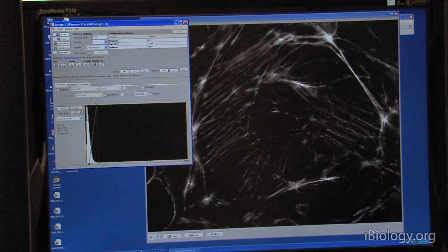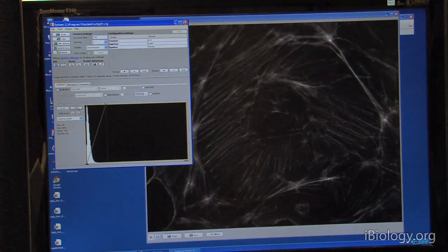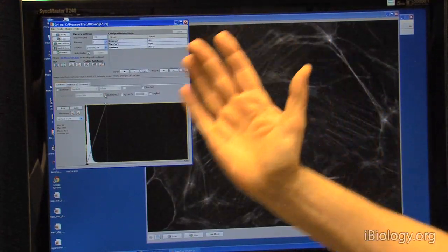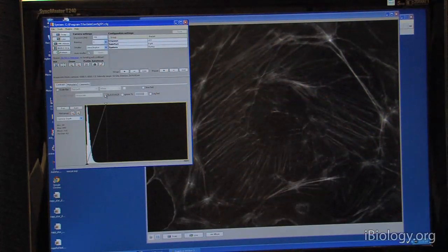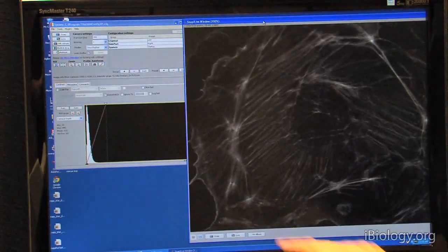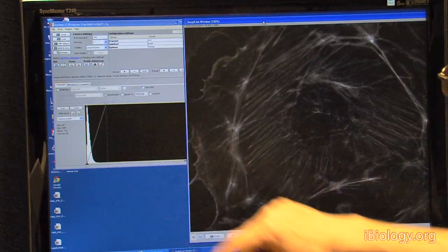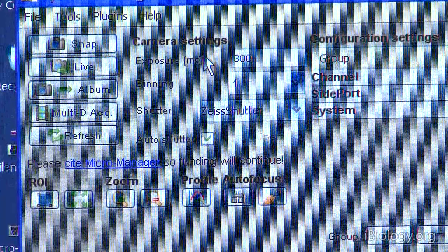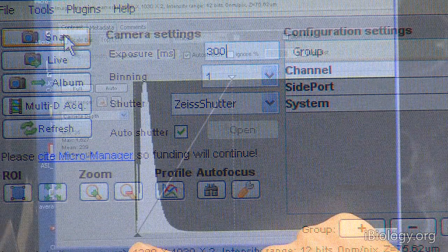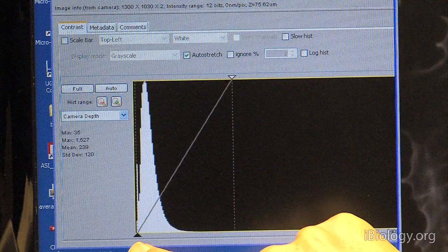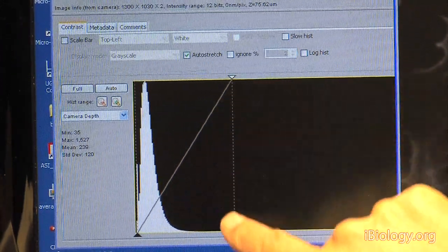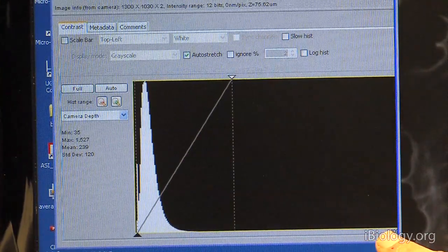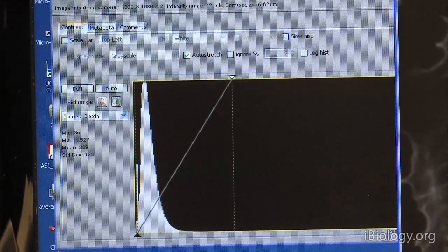Now, a very useful way to set this up is use the auto button, or to check the auto stretch checkbox, so that automatically, every time, the scaling will be applied based on the minimum and maximum pixel values. So, you always want to look at this histogram to see what is going on. For instance, if we now double the exposure time again, so we now go to 300 milliseconds, snap an image, then we see that our histogram moved out to the right. So, also our auto scaling moved further to the right. And so, in general, the more of your dynamic range, the more of your histogram you are using, the more information you have in the images that you acquire.